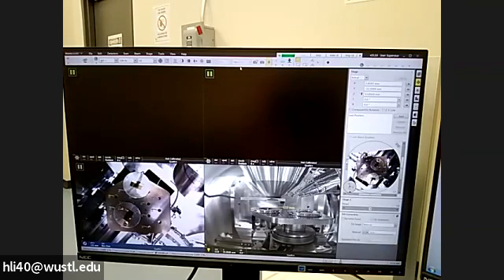Normally, I cannot click it until I start the scan. So I just highlight the first option so you can see. If you click here, we have a number of preset scan pixel sizes. Normally we use the second one or the third one. If you choose a high pixel count, you see it will take longer to scan through the whole window, the frame. Okay. The next thing is the camera, the snapshot. We use it sometimes. You can use the F4 button, or you can also use F6, I guess, to take a photo.